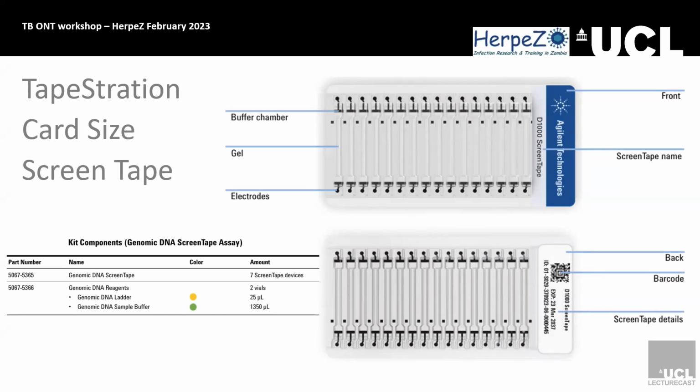And you get different reagent kits, so if you're doing Illumina, you can buy really small sized kits, or, say, we use the gDNA ones. I imagine, because they run roughly the same, maybe the gel is thicker in the smaller one, so you get better resolution.